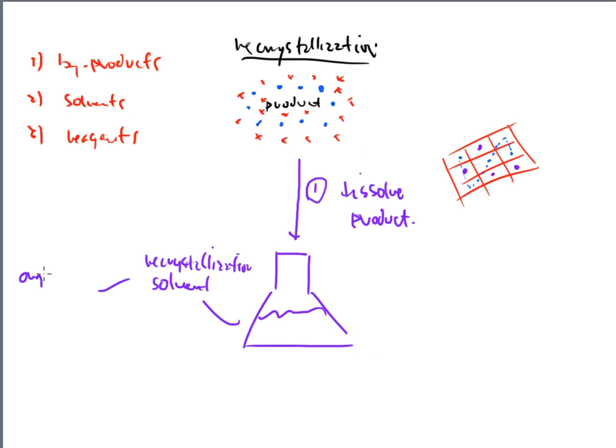Fancy means organic solvents that we get from a back flammable room. We bring those out. We have to carefully handle them because a lot of times they're flammable. But sometimes this can be something just as simple as hot water.